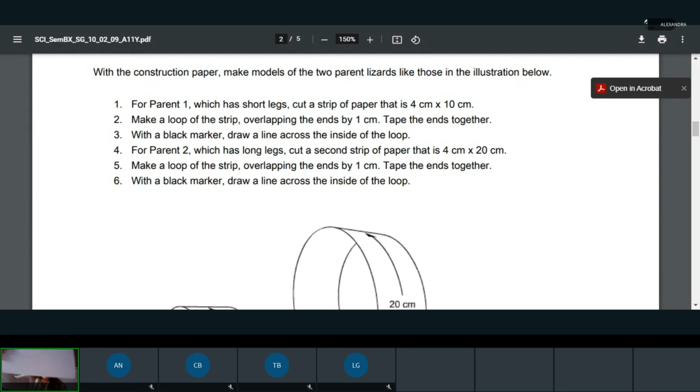Okay, so I've got my line, right? Can you guys see that? There's my 10 centimeters. Now, with my ruler, I want to measure from that line. I don't know where it is. This is really hard when you do it backwards. Okay, so there's my line. Now from there, I want to measure 4 centimeters, and I'm going to draw a line 4 centimeters long. Like that.